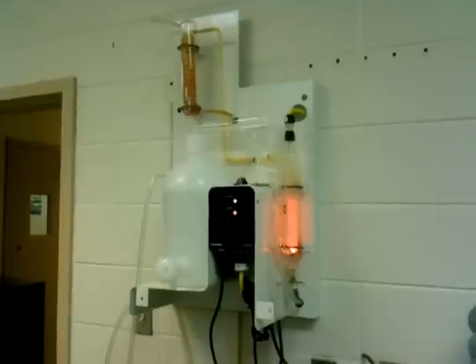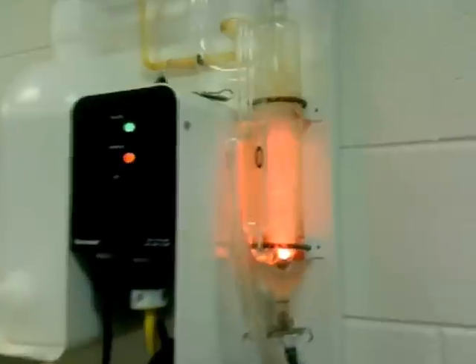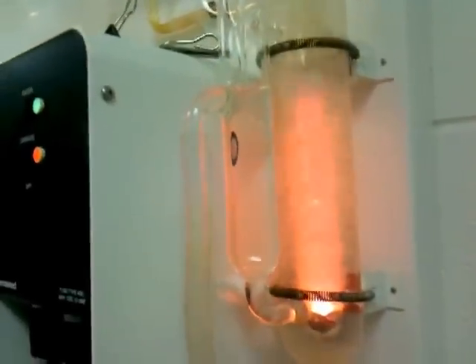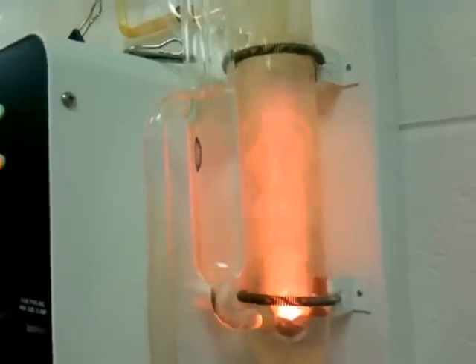This is a water distiller. What we have here is a simple heating element — it's glowing red, just like a toaster. It's just a hot element inside there, and it's boiling water.